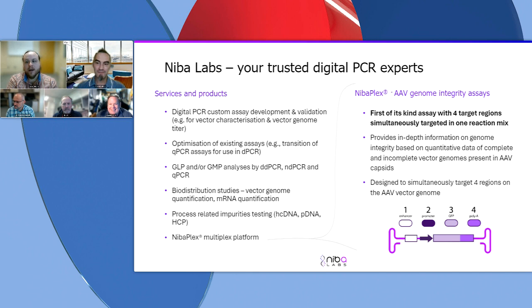All of it. Because the setting up, now that there's the crosstalk matrix, does make it quite simple. One of the issues, like David was saying, was once you get all your parts and pieces, sometimes you'll have issues even if in silico it made sense. And a big one there is the bleed through. Being able to cut out that bleed through makes it a much cleaner assay. So the data is a lot cleaner, and your thresholds are drawn a lot better. So at the end, it does make for an easier data analysis.